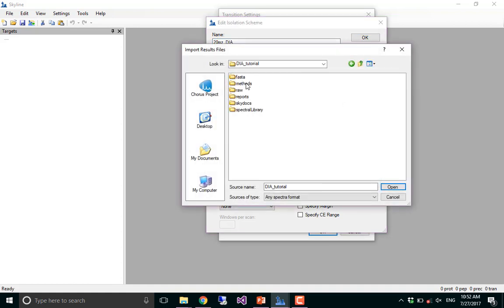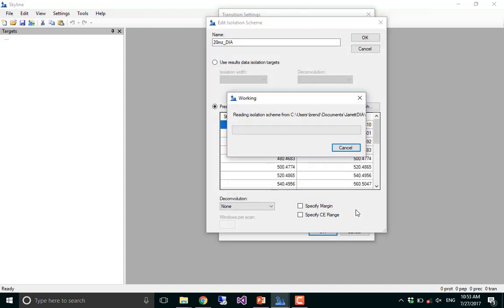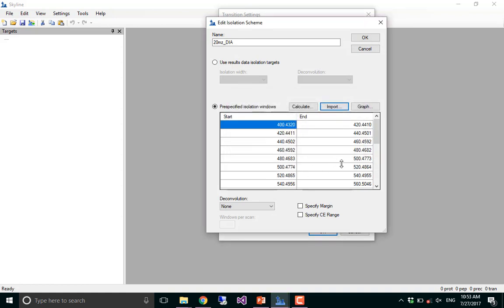I've never used that feature. Right, that we made it possible for Scott to just figure it out, and it figures out, using swap overlapping windows and all that.